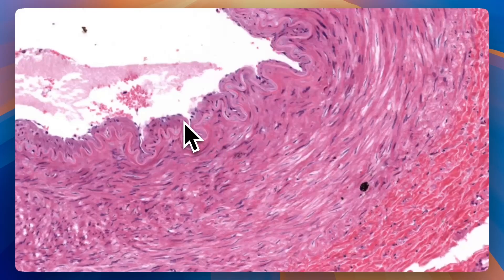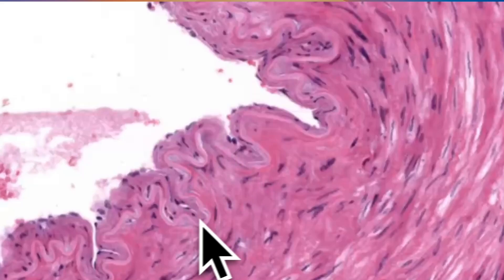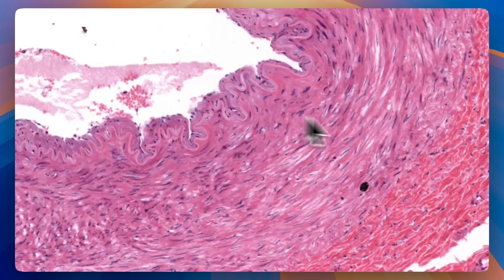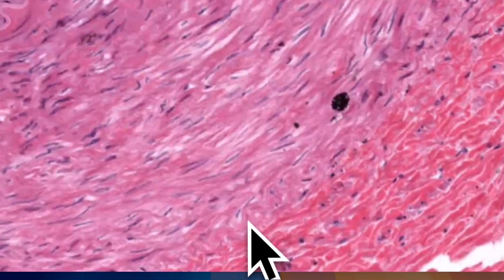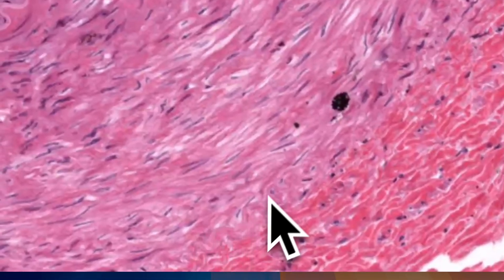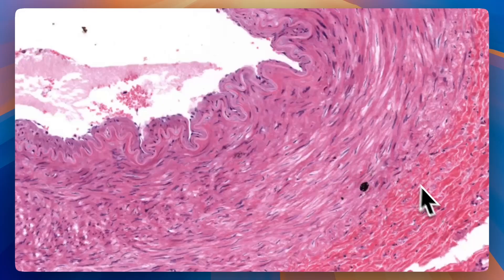In muscular arteries you'll find two of these layers that you can use to define the boundaries of the tunica media. There's an internal elastic lamina closer to the lumen and an external elastic lamina a little bit closer to the tunica adventitia. The internal elastic lamina is in between the intima and the media; the external elastic lamina is in between the media and the adventitia.